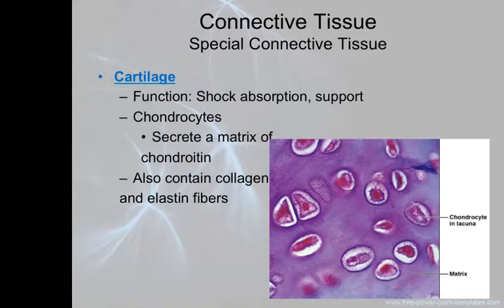The chondrocytes, these are the cells of cartilage. They live in small spaces called lacunae. You'll see the term lacunae again. Singular is lacuna, plural is lacunae. Anytime you see that term, just think of a small open space.